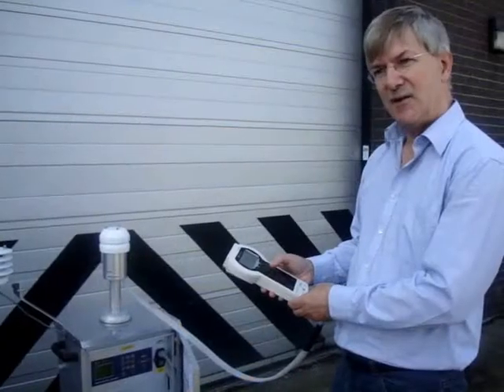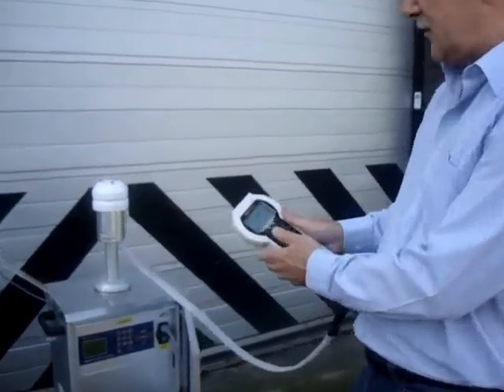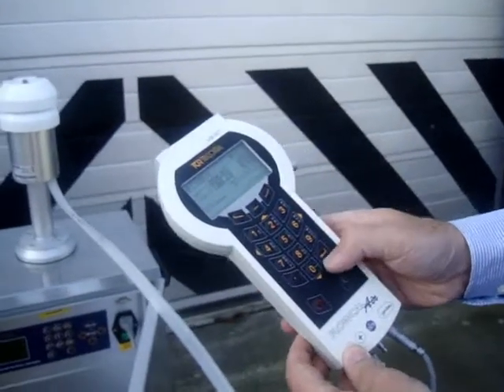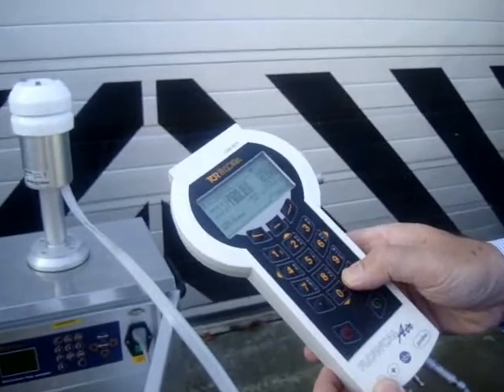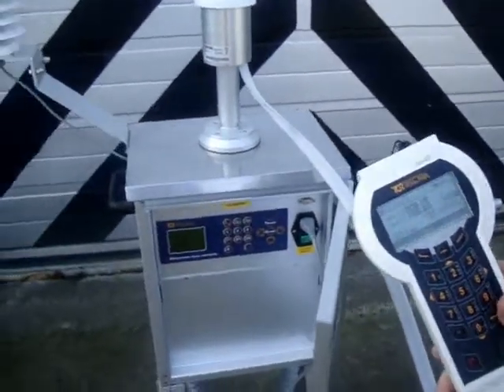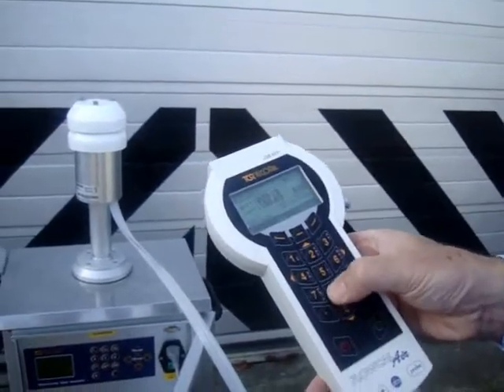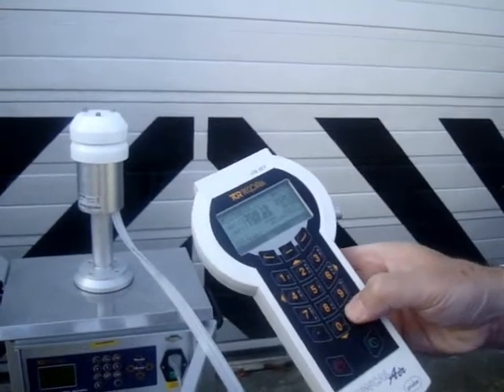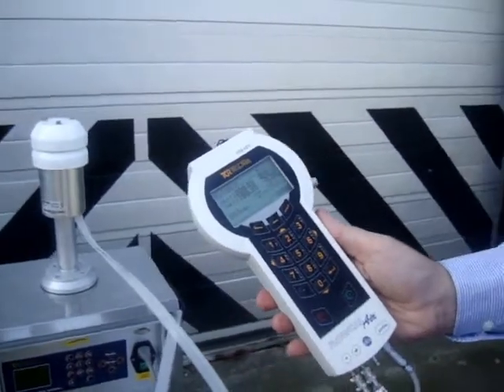When it's settled to the target value, we start a measurement to be recorded. Press enter and observe the value on the display, and enter that into the sampler. Point 1 is now stored.